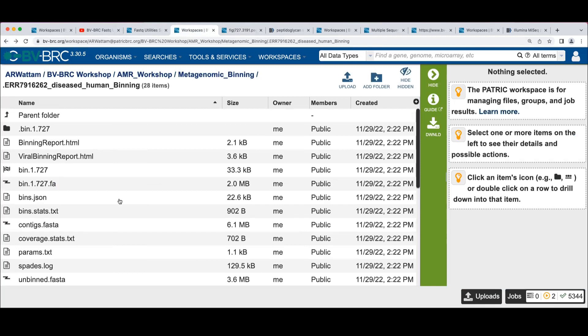And a good thing to point out is that once you have annotated, you can assemble a genome and you can use the contigs for several services in the system, or you can take them with a RAST system in PATRIC, you can proBIa, whatever, for that thing.